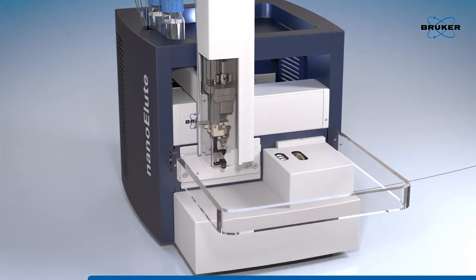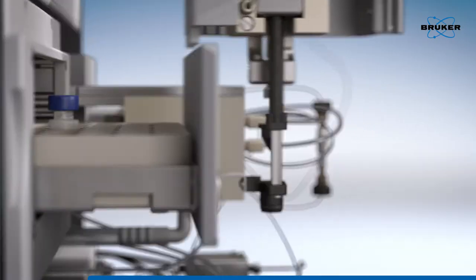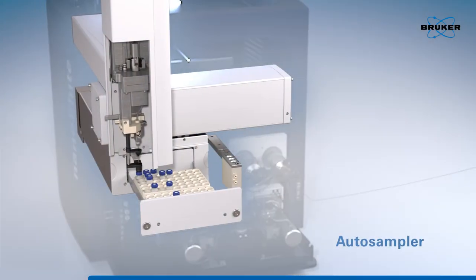Bruker now innovates the field of NanoFlow UHPLC-MS workflows and has designed the NanoELUDE instrument from the ground up with robust market-proven components.